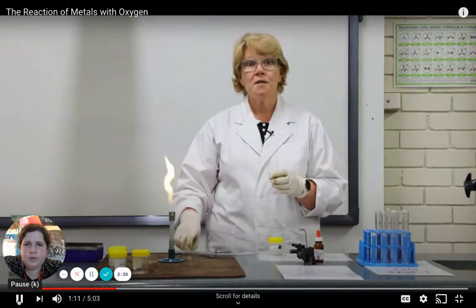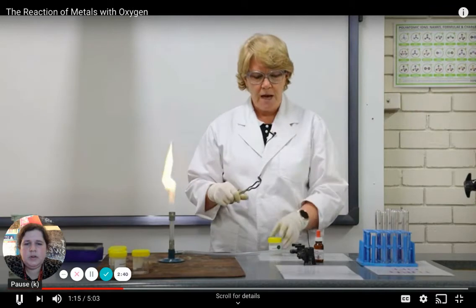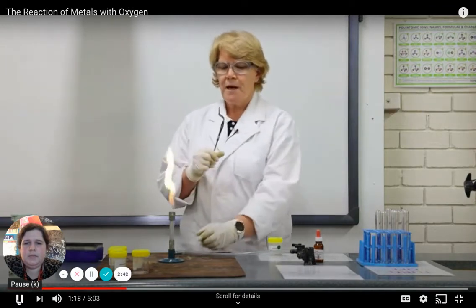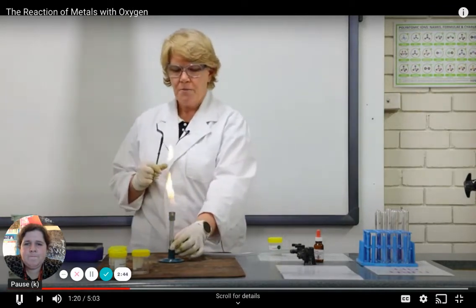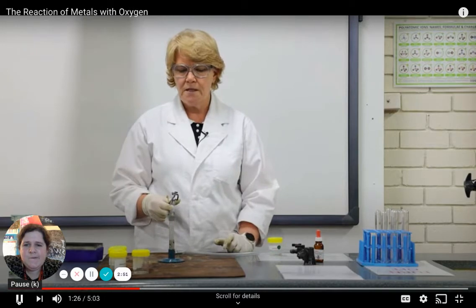This is not as fast as the reaction between sodium and oxygen because magnesium's not as reactive. We've probably seen this one before, around Halloween. I have my piece of magnesium ribbon and my Bunsen burner. Magnesium starts out as a shiny silvery ribbon. I'm going to put it in the hottest part of the flame and let's see what happens.